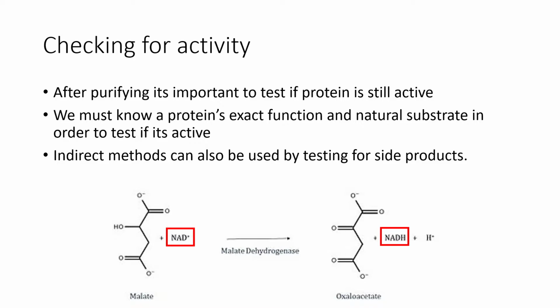So where we are now, we have purified our beta-gal, as well as checking the concentration of our beta-gal using the BCA assay. So now we really know how much beta-gal we're working with, but we don't really know if our beta-gal is active. For all we know, our protein could have degraded somehow where it got all chopped up. Or more likely, it could have been denatured where the protein starts to unfold and unravel into different configurations. And when this happens, the protein loses its function. So today's lab is basically trying to focus on, is our protein actually active, yes or no?